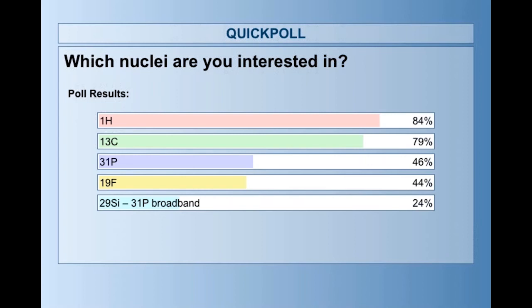Yes, so benchtop NMR literally means on the bench, or in fact, in the case that Ryan is going to talk about, his instrument is on a trolley that can be easily pushed around the lab to be as close to the reaction that he wants to monitor as possible. So, Bilal, hopefully that clears up what we mean when we say benchtop.